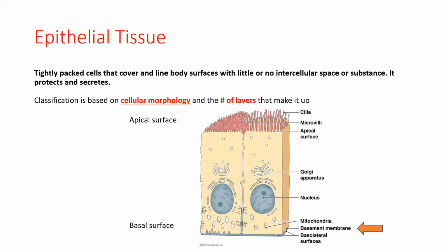If you see an apical surface and a basal surface, you're most likely looking at epithelial tissue. And so it was one of the key questions that I ask myself when I'm presented with a histology slide. That's going to be really helpful for helping you identify epithelial tissue versus connective tissue, because connective tissue will not have a clear apical surface or a clear basal surface.